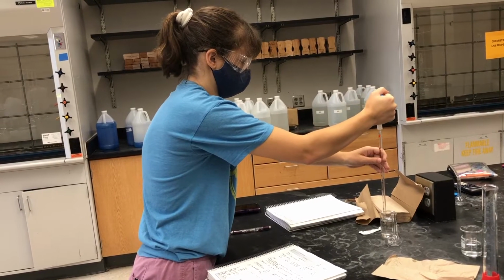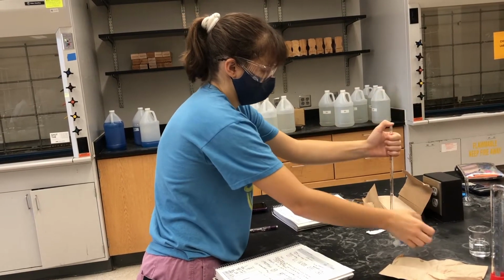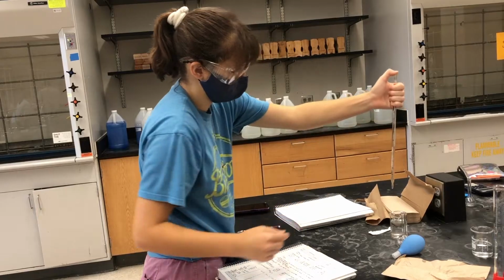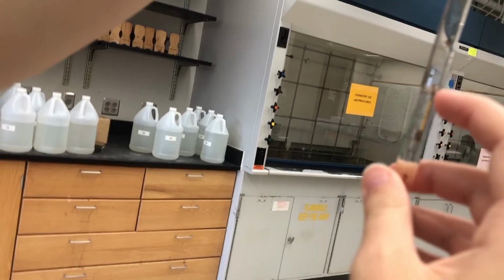Mai is wearing proper lab attire. Her shoulders are covered, her hair is tied back, she is wearing her goggles and long pants. Her shoes are closed-toed. This ensures her safety while working with potentially harmful chemicals.